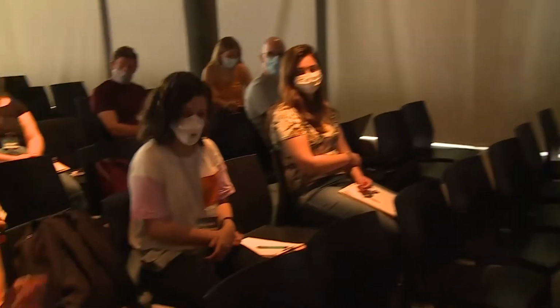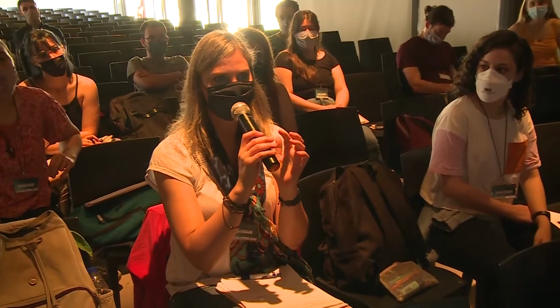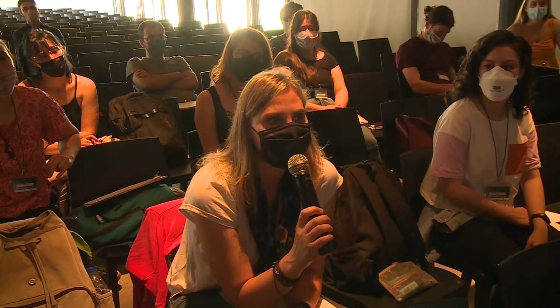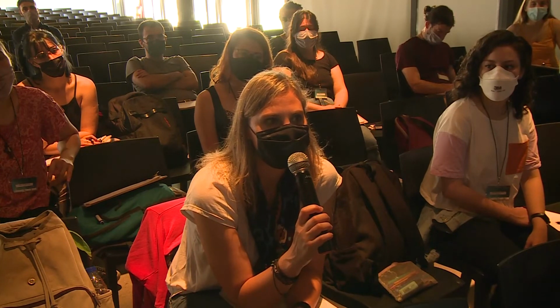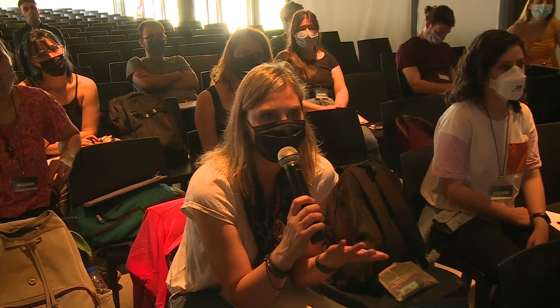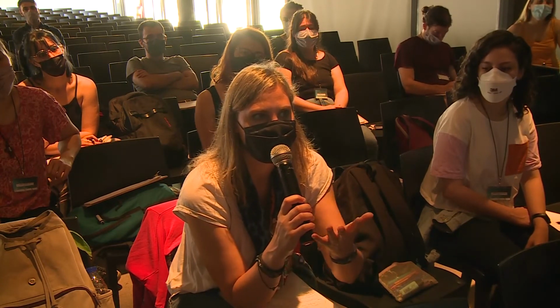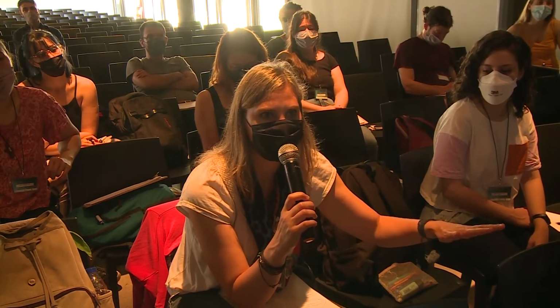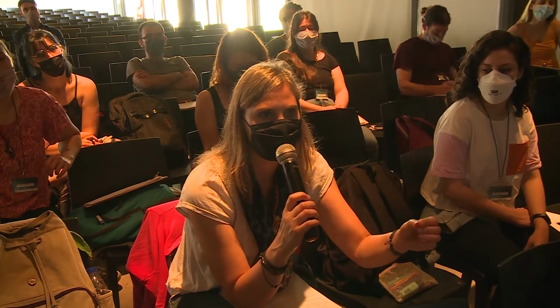Hi. Hola. Very nice talk. I enjoyed it a lot. I have just a question. What kind of negative control do you have to perform in this kind of experiment? You need to do the same experiment in the absence of proteinase K?